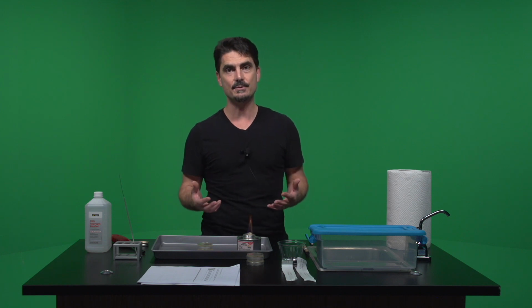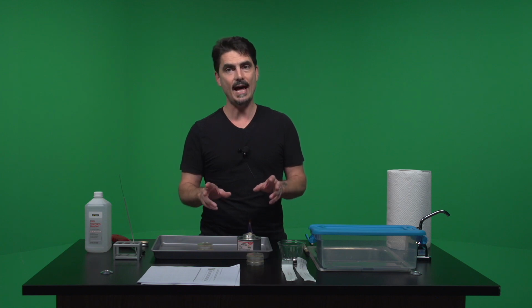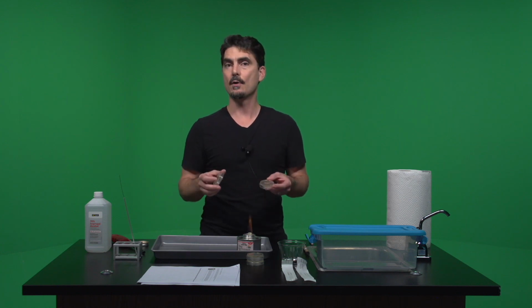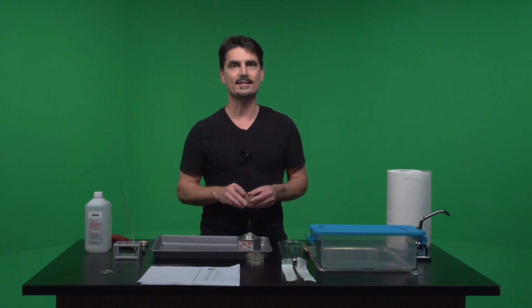to do microbiology labs. So what you'll see is, in the next set of labs, I will have all of my safety gear on for the lab, and that will allow me to do things safely. So that is the only reason why in the first lab you don't need to wear your goggles, you don't need to wear your gloves, you don't need to wear your aprons. That is because none of the plates we have right now have bacteria that we have grown. Because once they've grown on the plates and they're in high numbers, that is when there's a potential for contamination and for you to get sick.